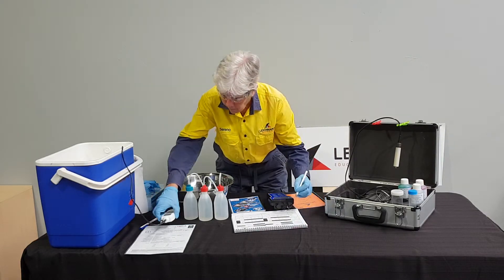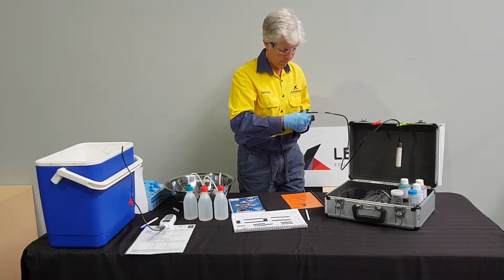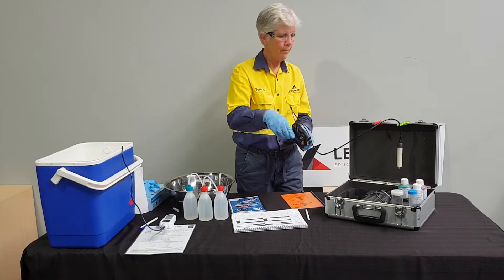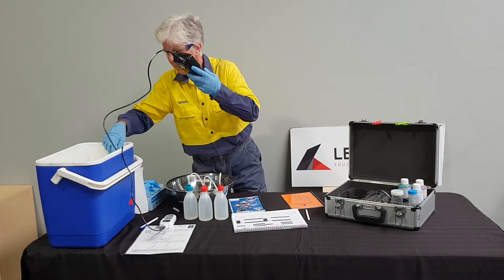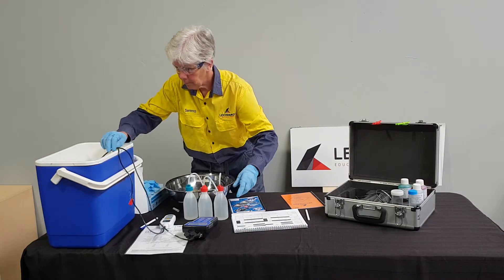Serena is now going to connect the temperature and conductivity probe to the WP81 metre. The connection is checked and the instrument is turned on. The probe is submerged in the water bath with the certified thermometer and left to stabilise for a couple of minutes.